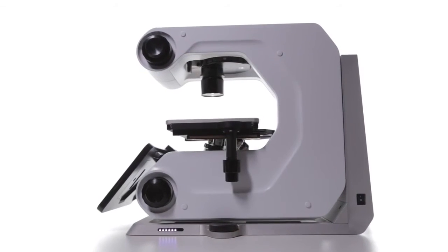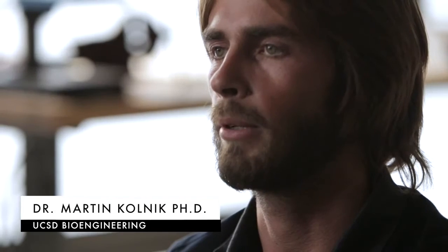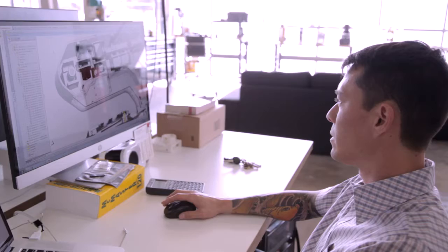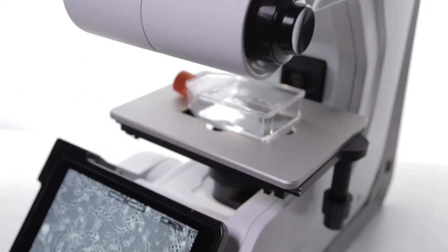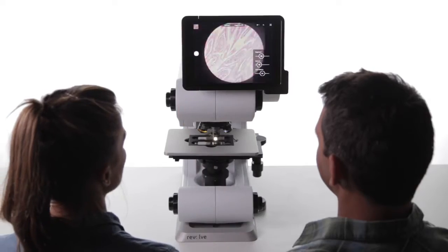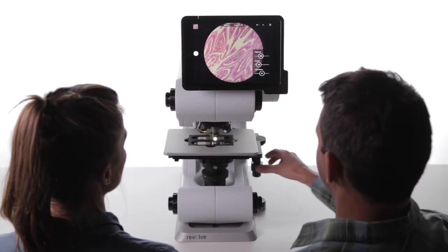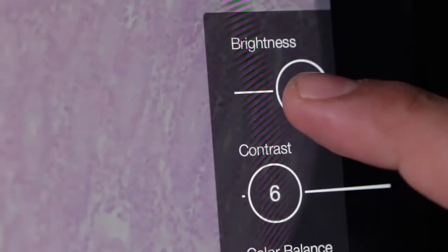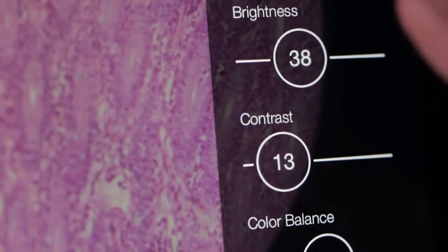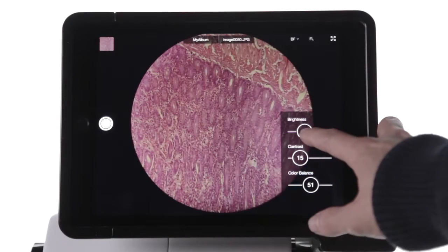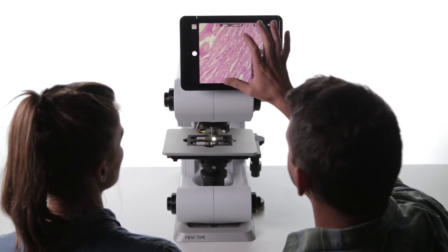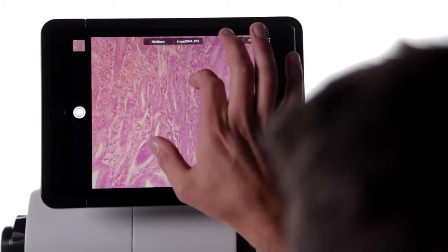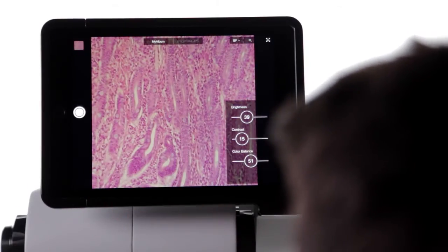I use automated inverted fluorescent microscopes for the majority of my Ph.D. research. The software was extremely cumbersome — it has a lot of different options, but it's not streamlined for the user experience. What the Revolve does with its tablet is it puts everything right at your fingertips in a very user-intuitive way that we've all become used to. It literally allows you to just touch the interface and capture beautiful, high-quality images instantly.